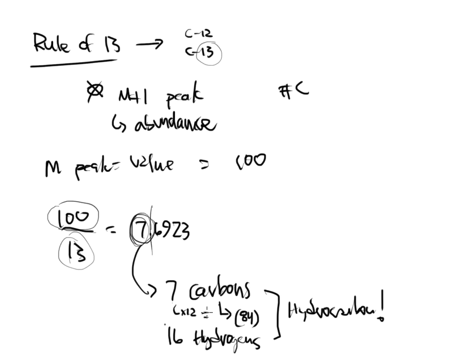Only thing I'm saying, 7 carbons in total. Who knows how they're hooked up? I don't really care at this point. And there's 16 hydrogens that's probably going to come along with this if it is a hydrocarbon. If it is a hydrocarbon. All right?